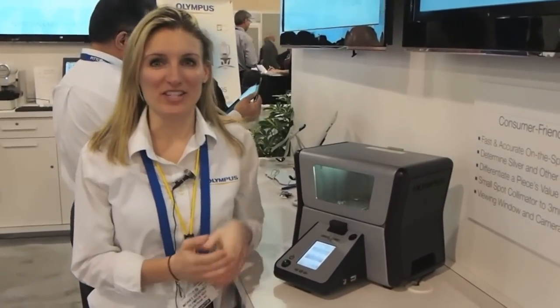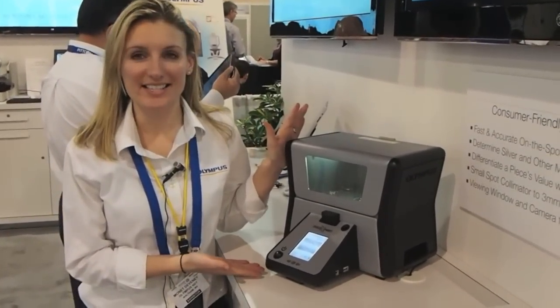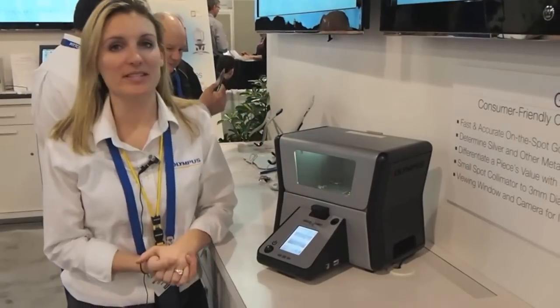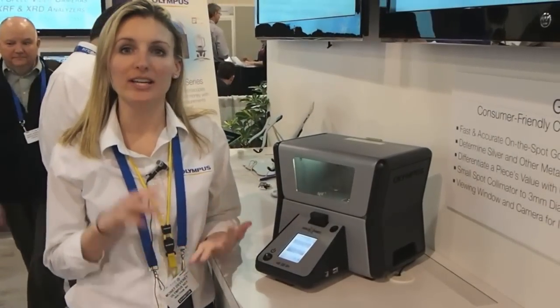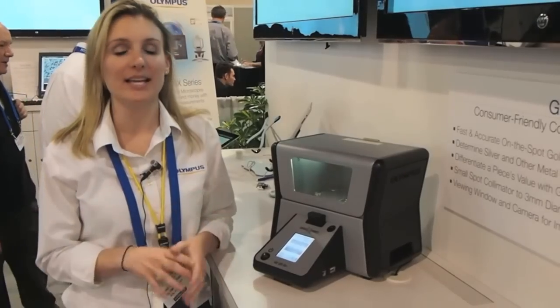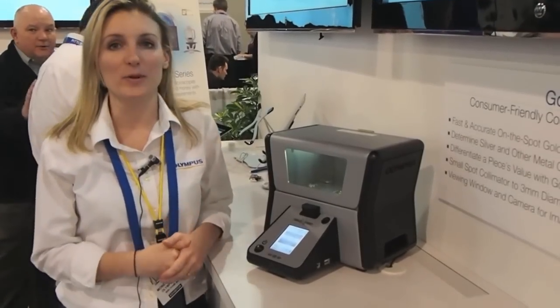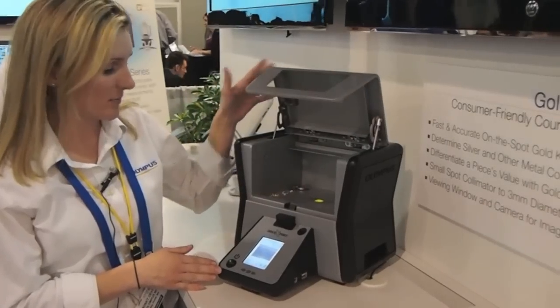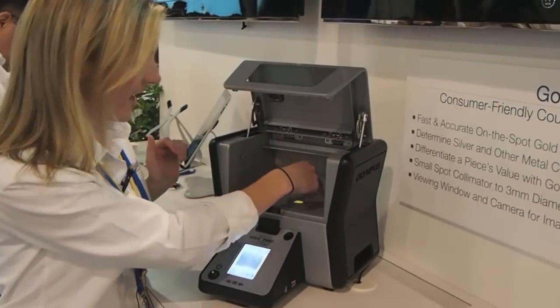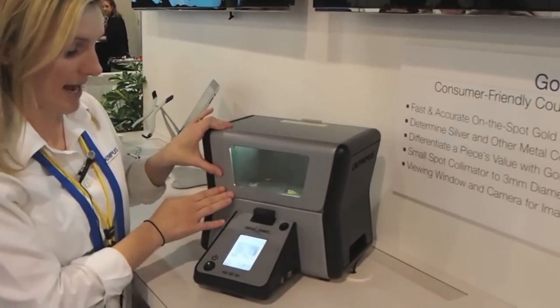Hi, this is Monet Devaney, and we're featuring our Gold Expert product today. The Gold Expert was designed specifically for the precious metals industries — jewelry, cash for gold, casting — and the idea of this instrument was to create a convenient form factor to be able to take precious metals samples and measure them quickly and accurately.